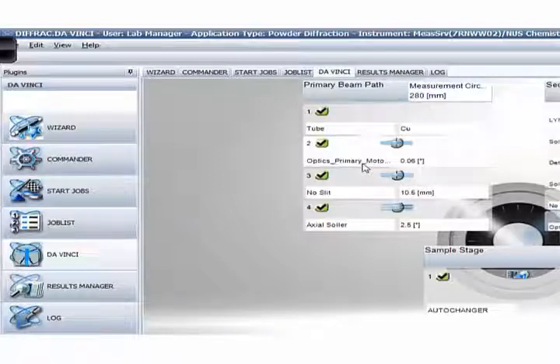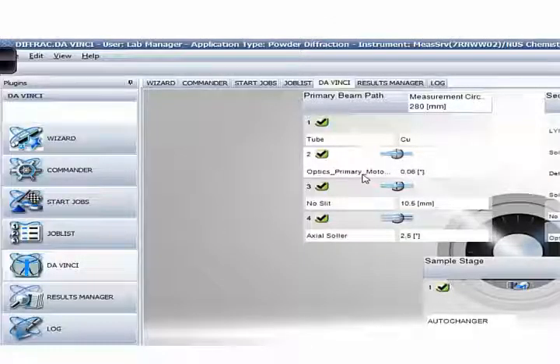The same goes for the secondary box and the stick mount for the copper filter. Even the axial Soller at position 4 — if I take it out and put it back in, it can even recognize an opening of 2.5 degrees. Most parts will be shown in the instrument configuration, except the knife edge — this is for low-angle scans, probably from 1 to 10 degrees. The knife edge doesn't have a chip, so for that you have to check it physically.